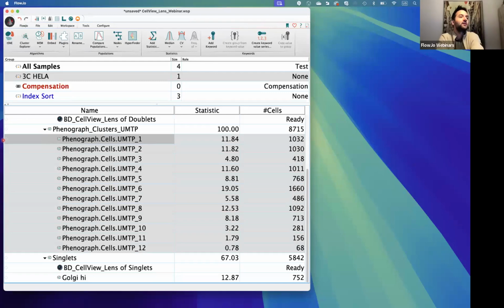Just a question first. Can you use the imaging parameters in R? How does one integrate with the fluorescent parameters, FCS plus TIFF file, using the plugin to extract the integrated FCS and then load it in R? I think you should be able to use those parameters in R. They're like flow parameters, just scaled a bit differently. So what you could do is export those.